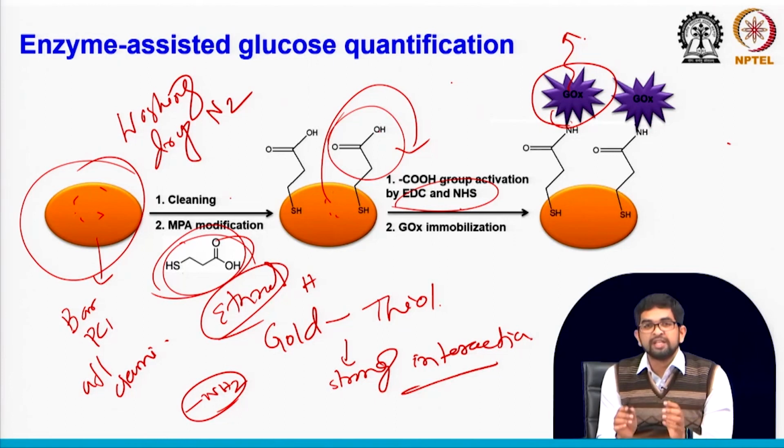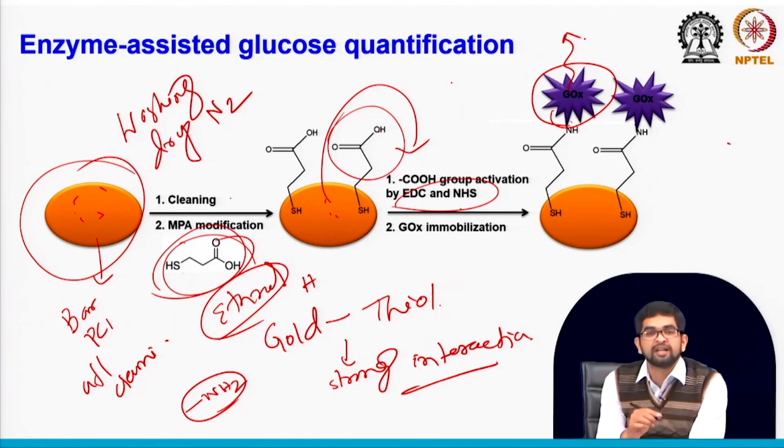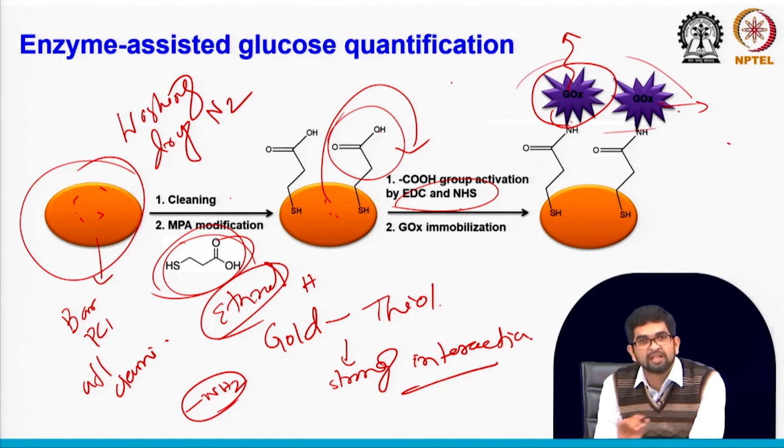So if you really want to form a point of care device, you have to think about extreme conditions, like very high temperature in rural conditions. If you want to store your electrode surface, a refrigerator may not be available, right? So how will you store this at 45 degrees Celsius in the summer time in a rural area? That time this kind of enzyme may be denatured easily. So maybe you have to stabilize the surface somehow, otherwise go for some non-enzymatic process. That is the drawback.